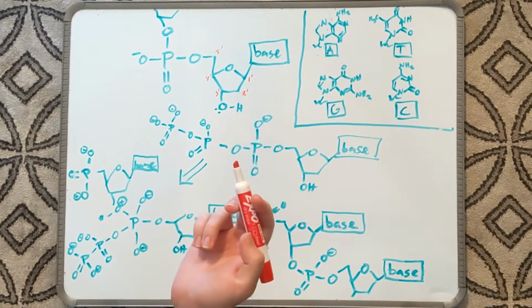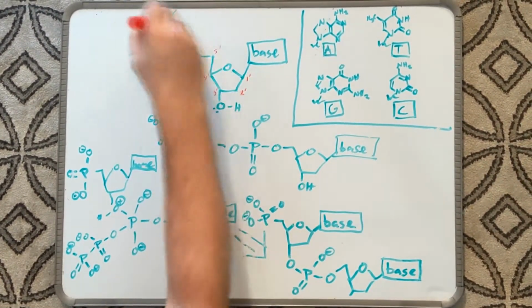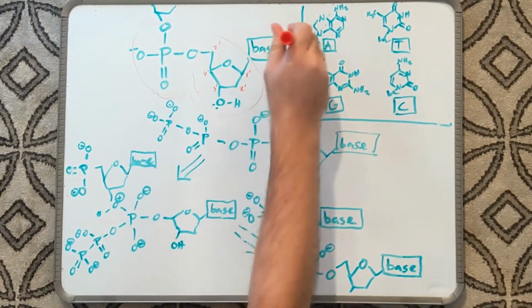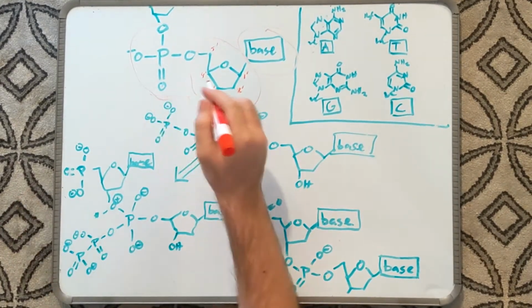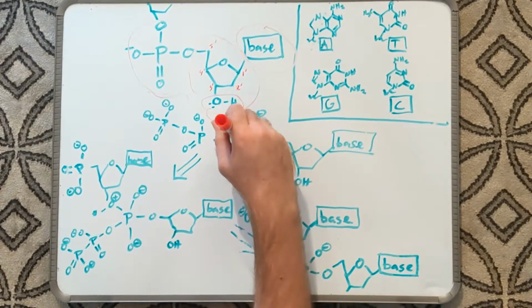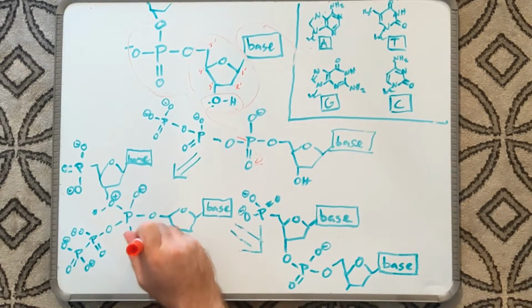DNA is the genetic material found in all cells. Each strand of the double helix is composed of nucleotides, which each contain a phosphate, a 5-carbon sugar, and a nitrogenous base. DNA is extended during replication or synthesis by the attack of the 3' hydroxyl of the sugar on the alpha phosphate of deoxynucleotides in solution, creating a phosphodiester bond.